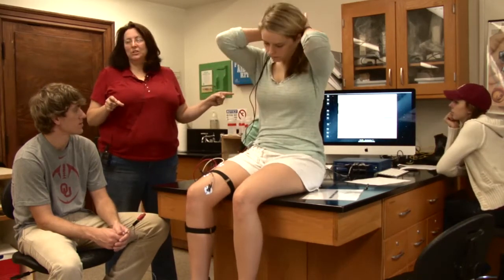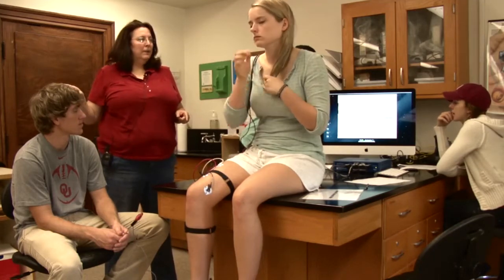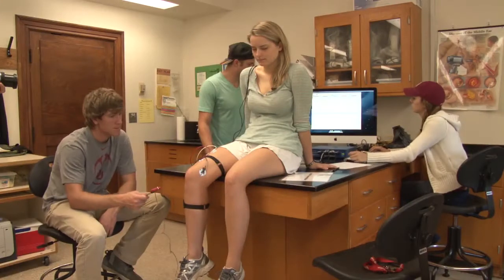The other thing that will happen is they'll invert the goniometer — they won't read the directions correctly on the calibration and the goniometer will go down. If the goniometer goes down, what do you do? Recalibrate — hit the wrench and recalibrate. The nice thing is you can do it right on the screen.